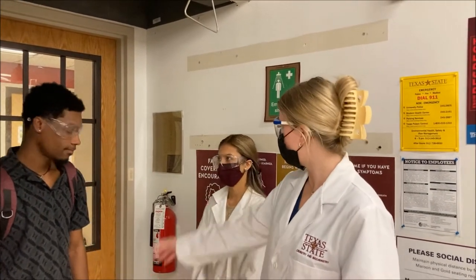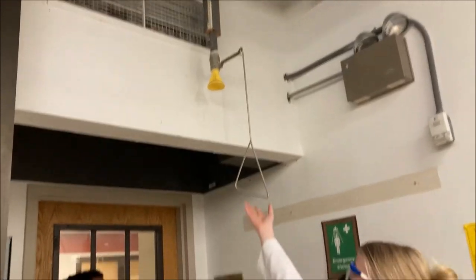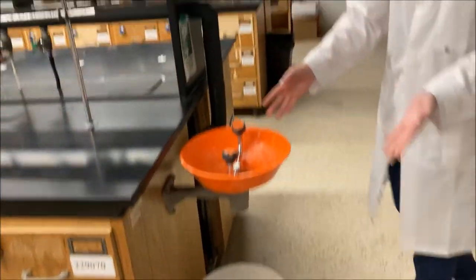Now for some of the lab's safety equipment. Over here you have a fire extinguisher. Right above this door is the safety shower — you just pull and it will shower down on you. And right here is the eye wash station. That covers some of our important safety equipment.